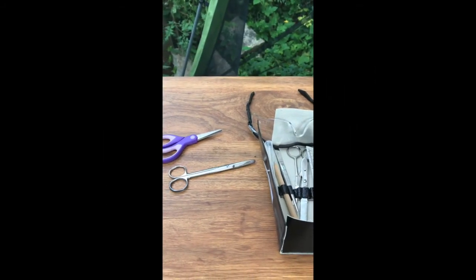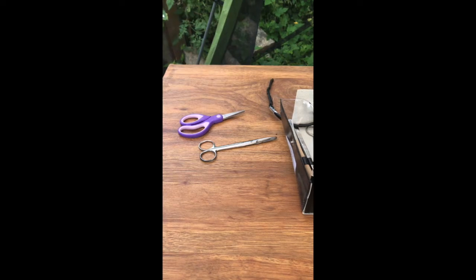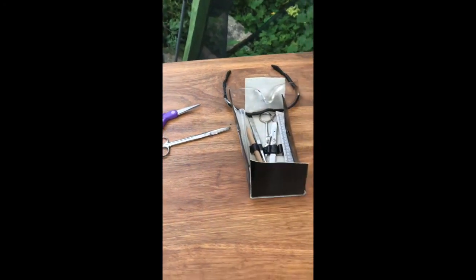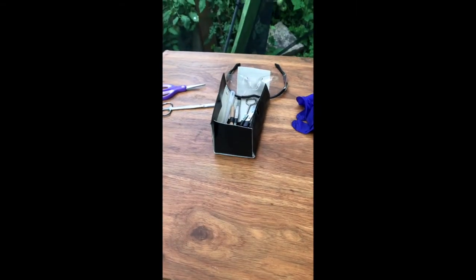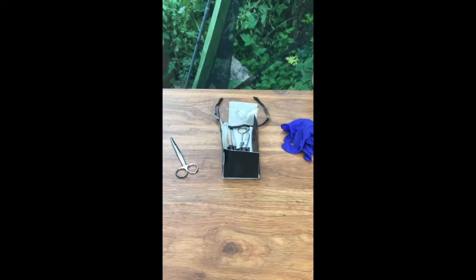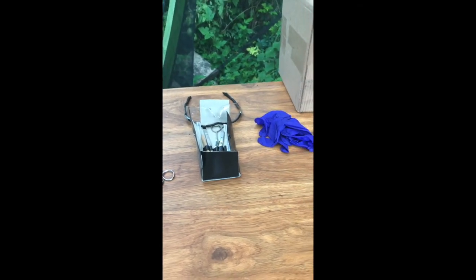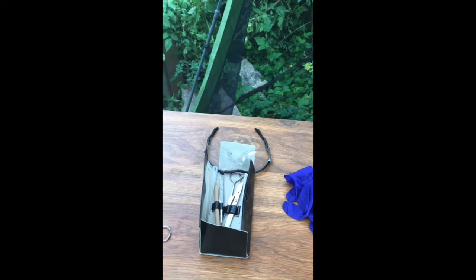I'm checking my list on what I should have, and it says here, always cut the shark open with a pair of purple and pink scissors, and have appropriate footwear. Okay, I read that wrong. It says, do not use purple and pink scissors, so we'll throw those away. Gonna use a more appropriate set of dissection scissors that do not have pointed ends. Okay, and then I reread the appropriate footwear, and what they meant is having a closed-toed shoe, so if you drop something sharp, it won't impale you.